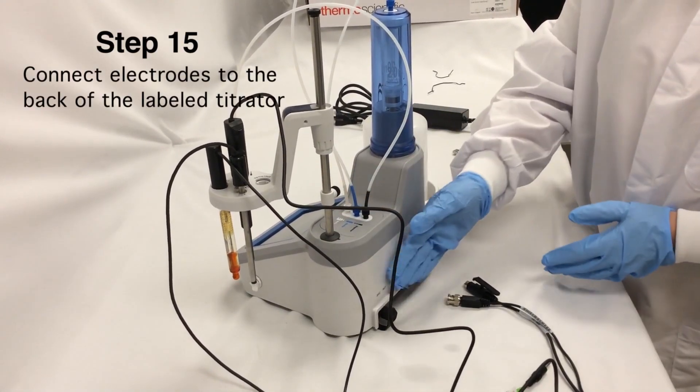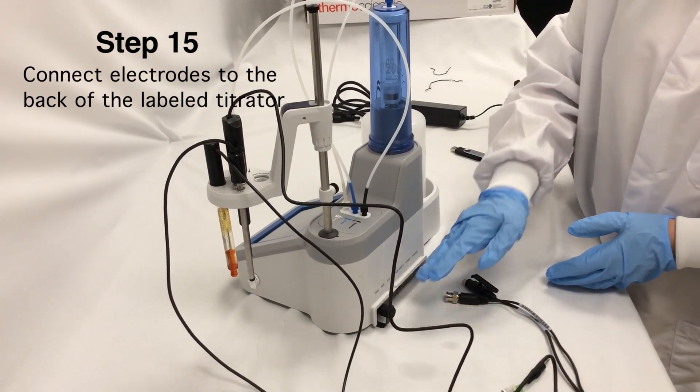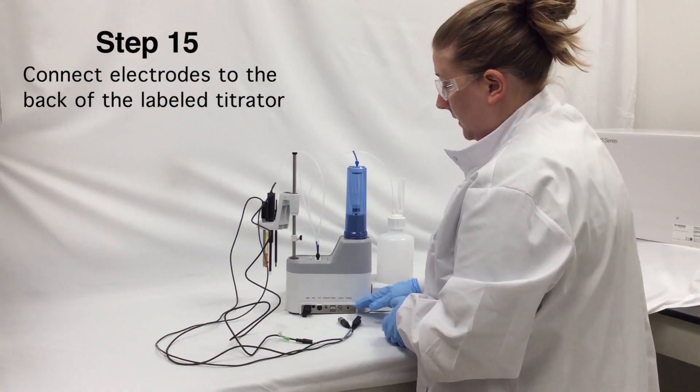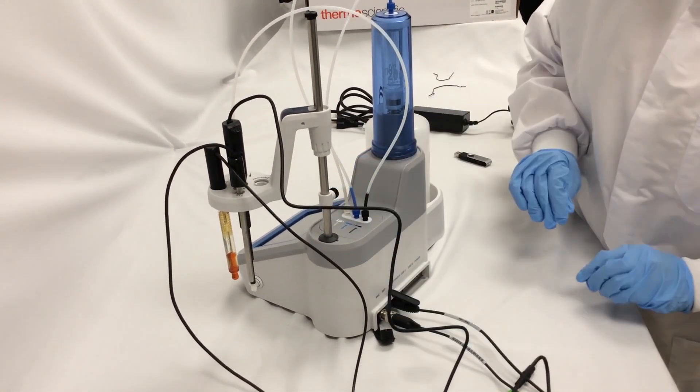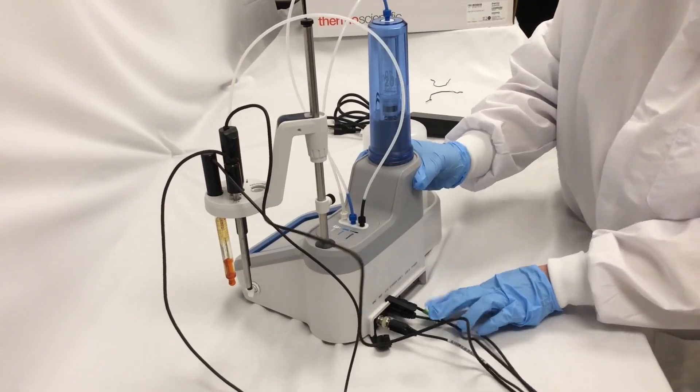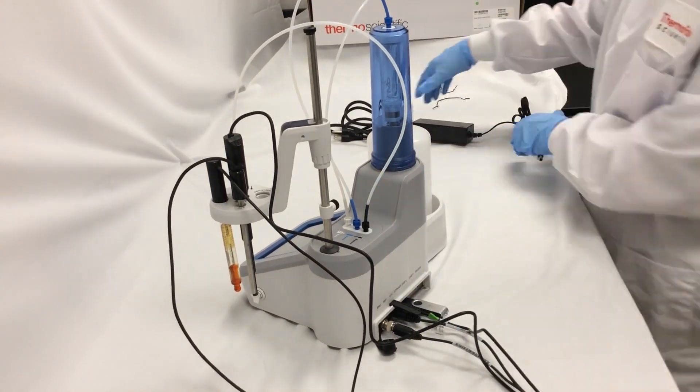Connect the electrodes that were just placed in the holder to the back of the titrator. The connections are clearly labeled, so just follow the connections. Finally, connect the power cord.